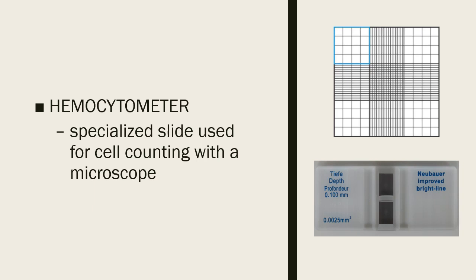And so you charge, you have actually a small slit here at the side, and that is where you're going to charge. After you charge, then you place the cover slip, and then you are good to do your cell count, differential count. And so this is the structure of this one. Okay, and so if you try to enlarge the one counting chamber, this is how it looks.